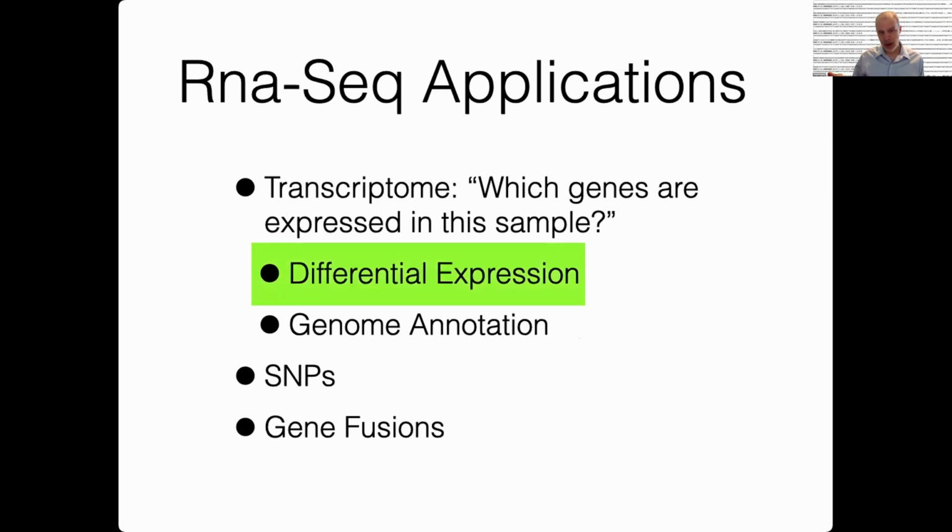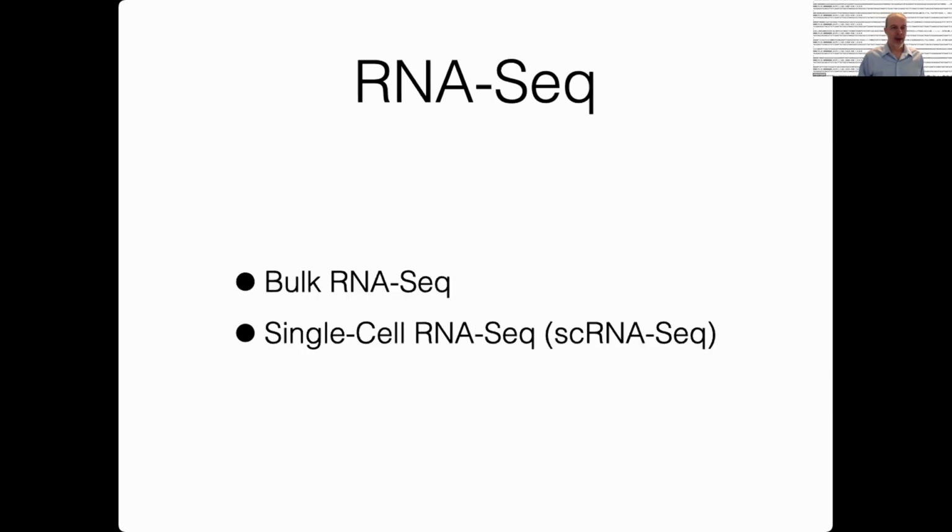And so what we're going to be talking about today is going to be almost entirely focused on differential gene expression. I already touched on this before, but there are different ways that you can divide RNA-seq data, and one way to divide it is between bulk RNA-seq and single-cell RNA-seq.